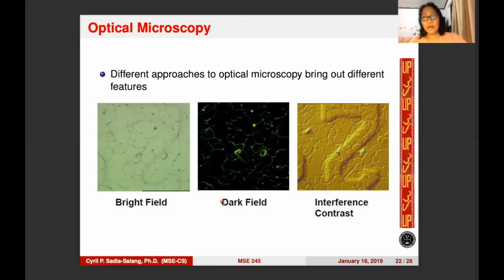Now, our book by Schroder has a good discussion about phase contrast microscopy and interference microscopy. In interference contrast microscopy, the system allows for appropriate phase adjustment for optimum contrast. Both edges of a raised portion of a sample can appear bright against a dark background or dark against a light background for monochromatic light.